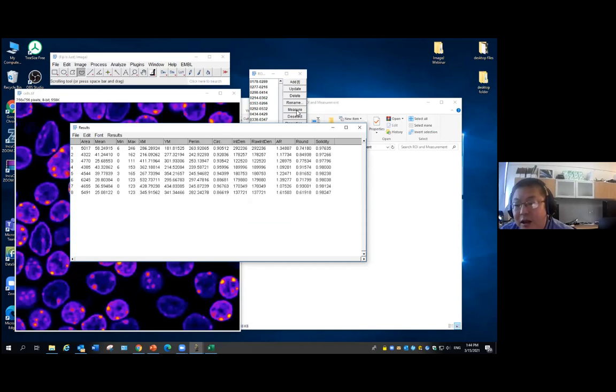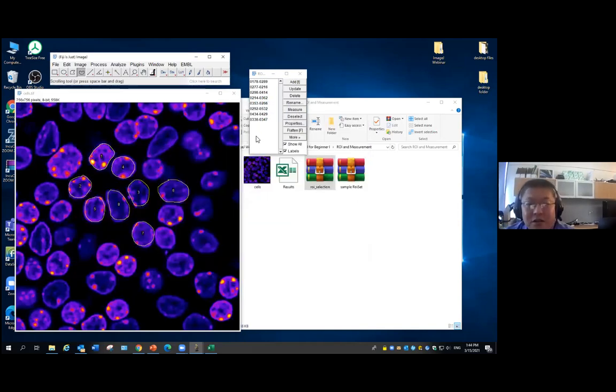So that's the simple measurement. That's if you do it purely manually. Ready? For tomorrow, we'll go through some process. If you're lucky and your image is good, we can try to make it more automatic for us, so you don't need to draw those cells by yourself. As you may find, sometimes it's actually quite hard to draw them, especially the cells around the edges. But if you're doing some very irregular shape, like neurons, it's really hard to draw them live.